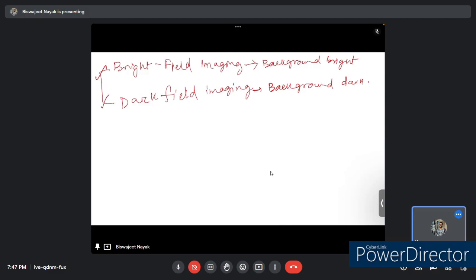Next, if it is not possible to use bright field imaging, how can the image be processed? There are different mechanisms employed to resolve those issues, and those can be resolved by either phase contrast or polarization microscopy, and there are other methods to curb the limitation of bright field imaging.